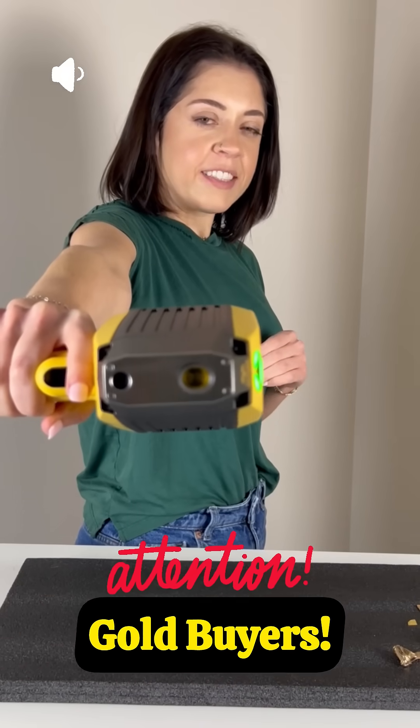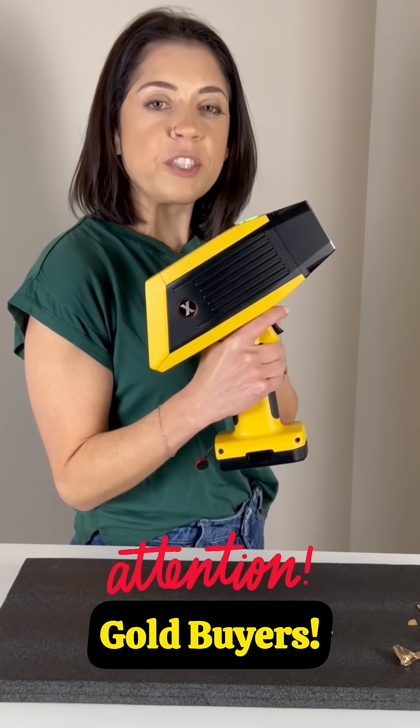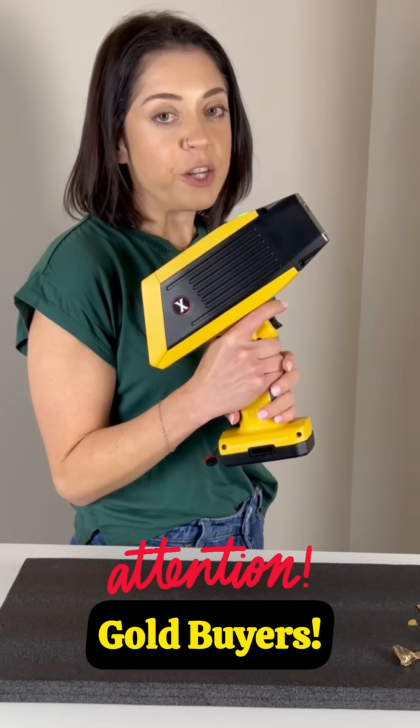Hold it! Are you a gold buyer? Then stick around. This is the Jamoro XRF Gold and Precious Metal Analyzer and I'm going to show you how to use it.